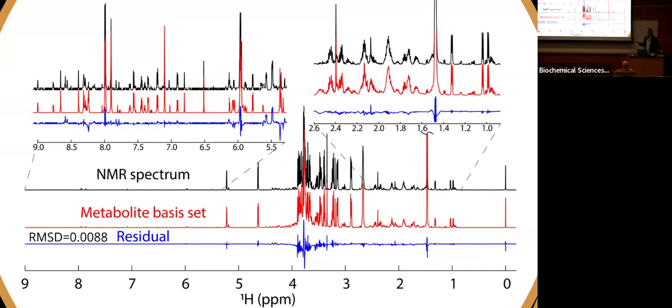It's the same spectrum that we have, but that's why it looks a little bit weird. But you can see that the fit's quite good. You can go through and find a few places where you have a peak that didn't show up or an extra peak that shouldn't be there. But for the most part, pretty darn good fit. The blue is the residual of the fit.